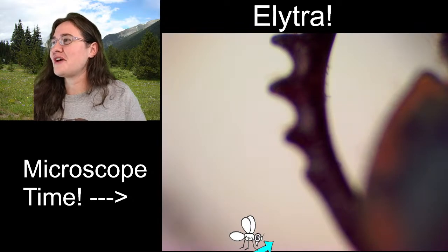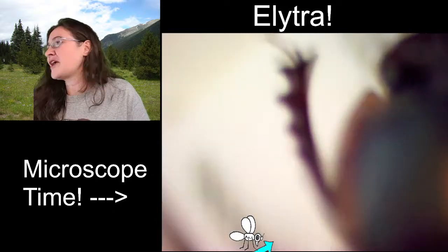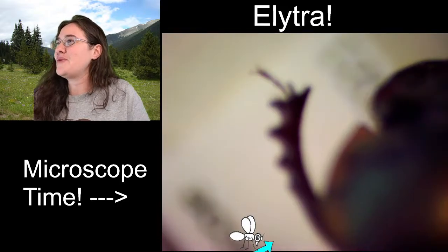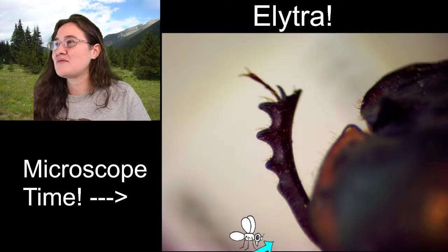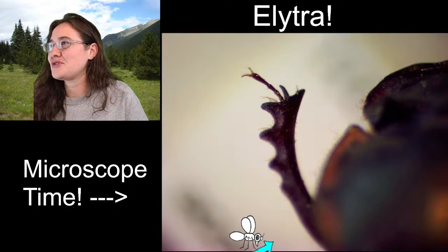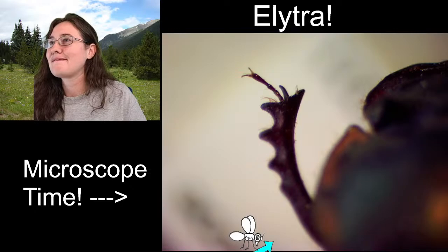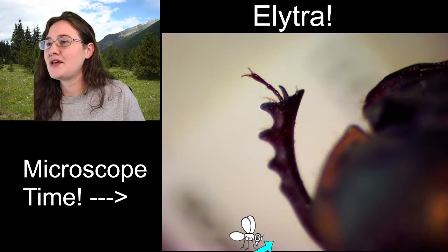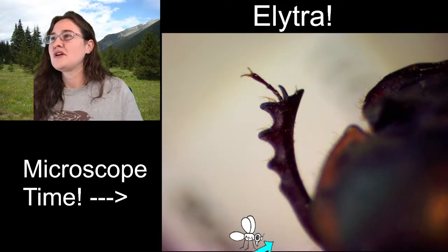I zoomed in too far. The viewer on my microscope is wider than the view on my camera, so sometimes I accidentally make it too close, because that's how I would look at it on the microscope. Come on, friend. There we go. Now it's moving. All right.